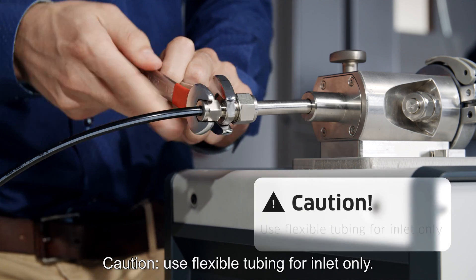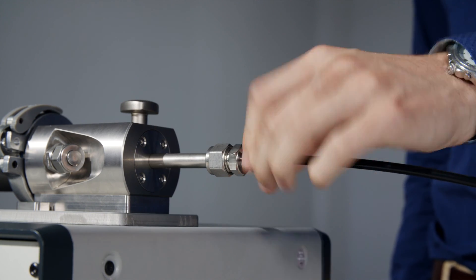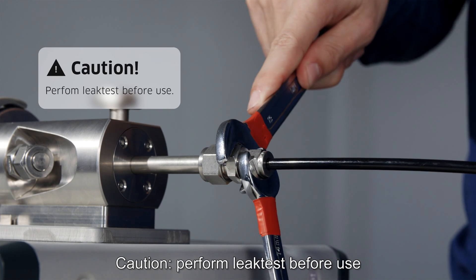Caution: use flexible tubing for the inlet only. Caution: perform a leak test before use.